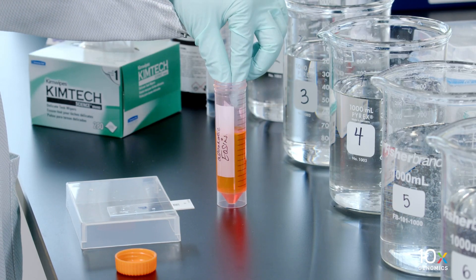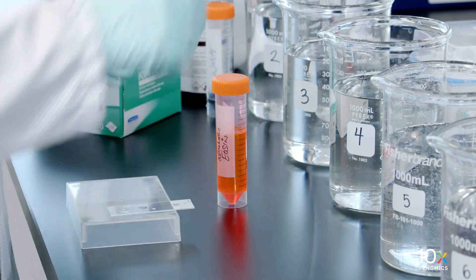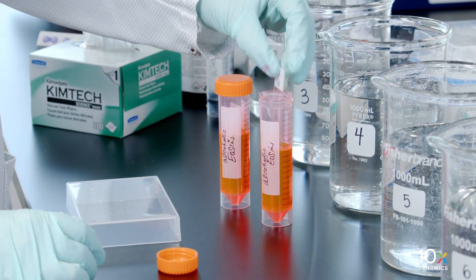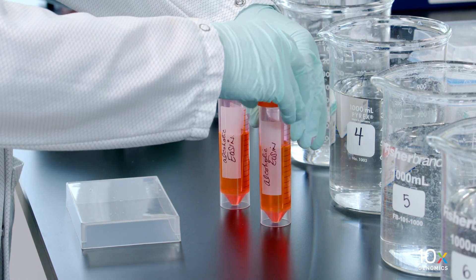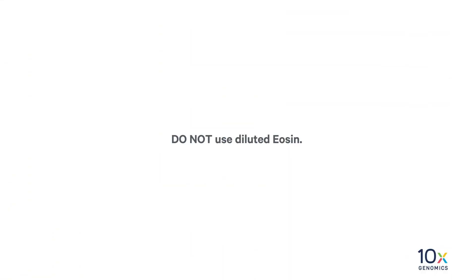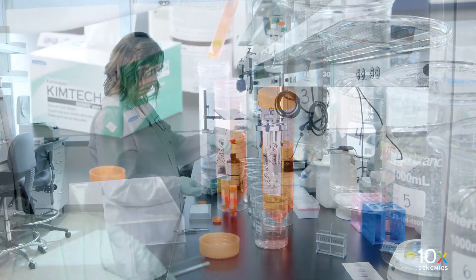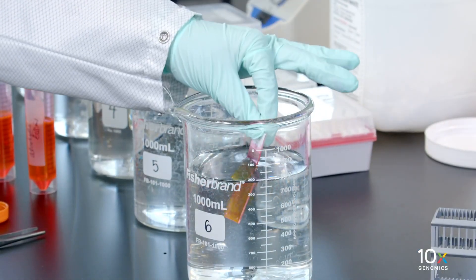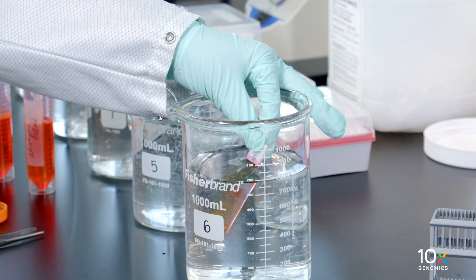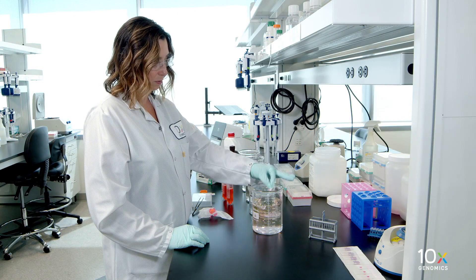Pour 30 milliliters of alcoholic eosin into a 50 milliliter conical tube. Gently immerse the slide in the alcoholic eosin solution. Incubate for 2 minutes at room temperature. Do not use diluted eosin. Discard the reagent by draining and/or holding the slide at an angle, with the bottom edge in contact with a laboratory wipe. Submerge the slides for 30 seconds in beaker 6, then dip the slides 10 times in beaker 6.